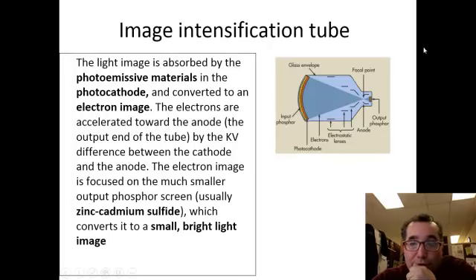So here is our image again. Just wanted to show you the image from a different perspective, but if you can see here, this is what I was talking about. Our electrons are being condensed into a much finer point.